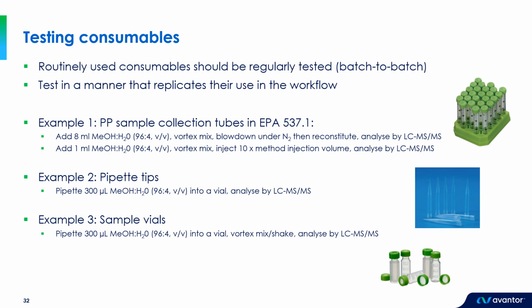I should probably mention at this point that the term PFAS free is perhaps rather misleading because typically we test for only a small subset of PFAS. So if we say something is PFAS free, what we really are saying is that we can't detect the PFAS that we're specifically looking for. There could, of course, potentially be other PFAS present, which we're not picking up with our LCMS method. So unfortunately, if you expand the range of PFAS you're analysing or begin working with a new method, you really need to do the rigorous testing for those new PFAS compounds as well, and not just make assumptions that what was PFAS free with method 1 is necessarily PFAS free with the new method.